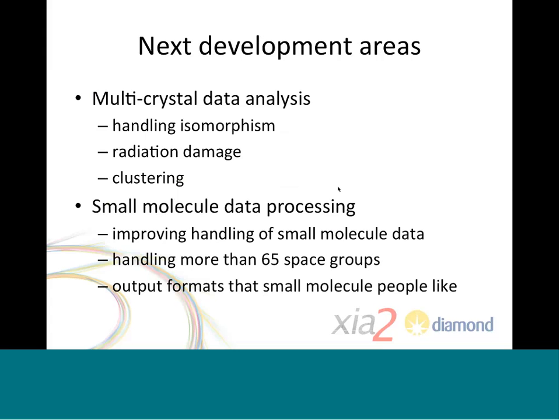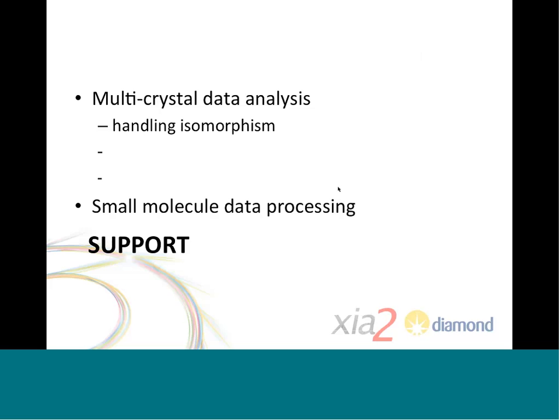The idea being that if instead of data from one crystal you have in the directory data from 10 crystals or 20 crystals, the system should be able to work as it does currently and make some sensible suggestions on how to merge the data from all of those crystals. The situation for the small molecule data processing is a bit more procedural in the sense of extending it to cope with the different space groups and so forth, but it's still where some effort is needed.